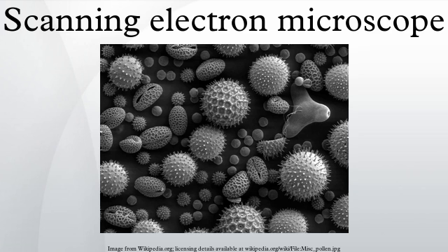Magnification. Magnification in a SEM can be controlled over a range of up to 6 orders of magnitude, from about 10 to 500,000 times. Unlike optical and transmission electron microscopes, image magnification in the SEM is not a function of the power of the objective lens. SEMs may have condenser and objective lenses, but their function is to focus the beam to a spot, and not to image the specimen. Provided the electron gun can generate a beam with sufficiently small diameter, a SEM could in principle work entirely without condenser or objective lenses, although it might not be very versatile or achieve very high resolution.